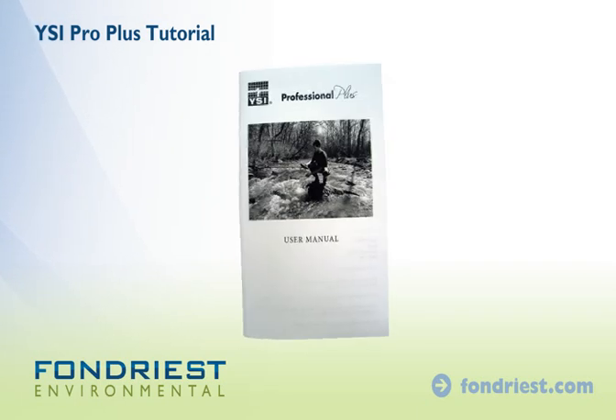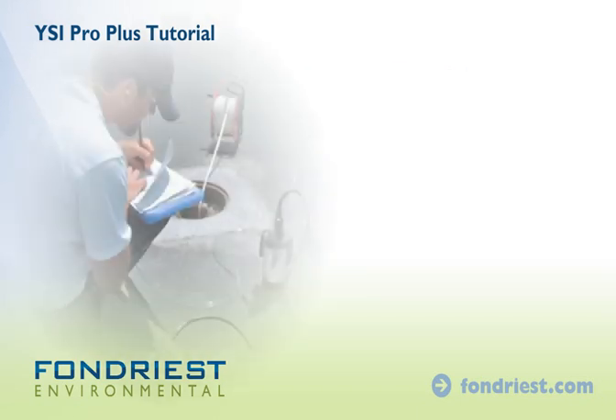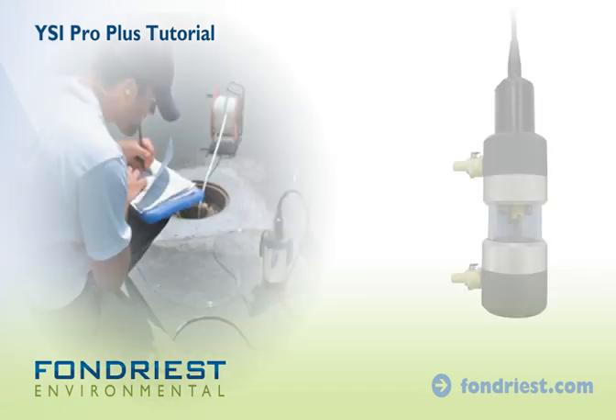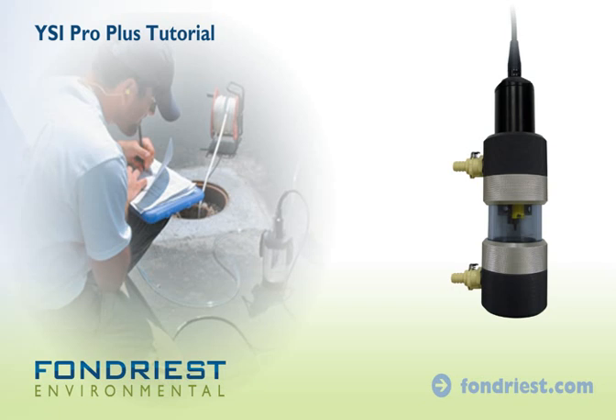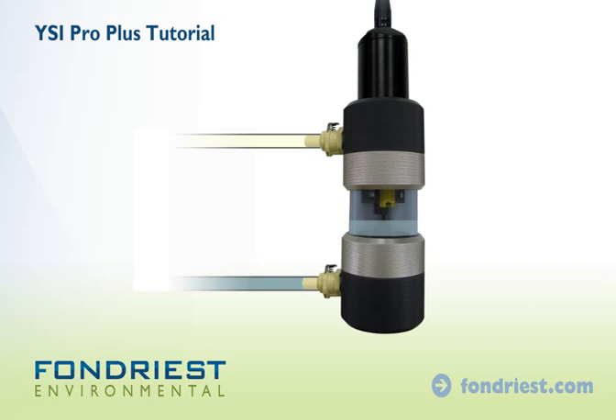Refer to the manual for setting up site lists and advanced locking options. For pumped groundwater applications, install the flow cell to the sensor bulkhead and connect pump tubing. As water flows through the cell, allow time for the sensors to equilibrate before logging data.